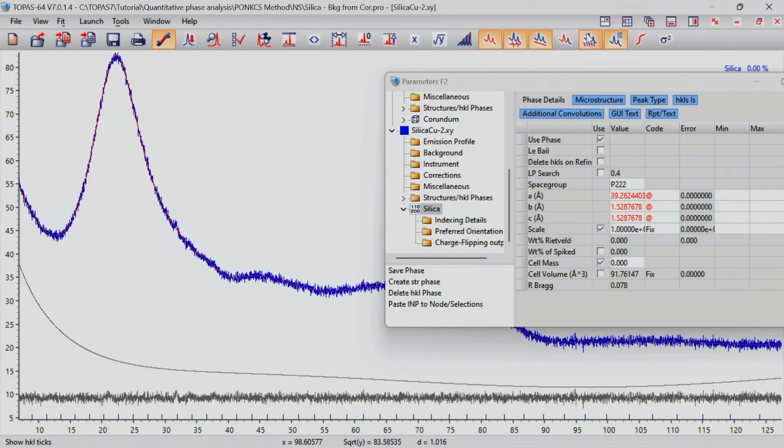I can, of course, represent such an intensity distribution with a series of single peaks, keep them fixed and declare them as my refinement model. Also, however, if I'm lazy in particular, I simply have chosen a space group which gives me a series of equally spaced peak positions.